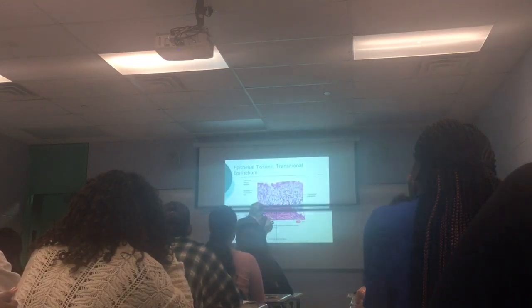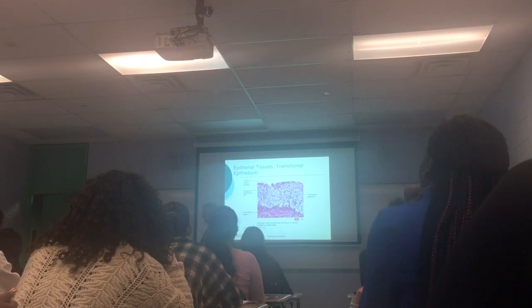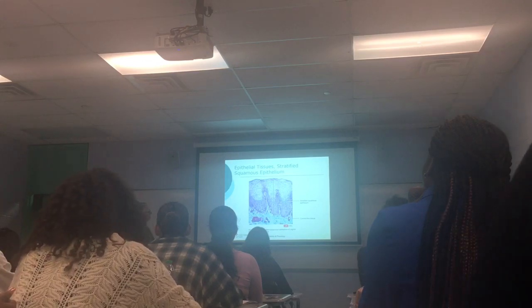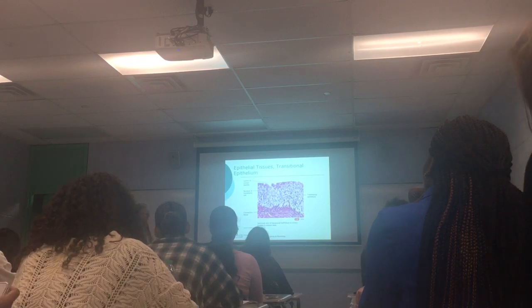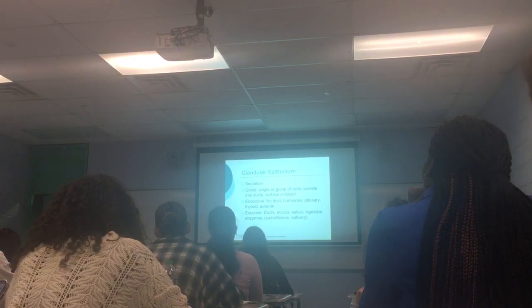So anytime, like if you're looking on a test, like not in here, but in cytology classes, okay? A lot of people mistake this for squamous cells, but they're not flat. See, watch, let me go back. See, these are flat. These are very flat. Okay, these look more rounded than anything else. But if you look at the connective tissue underneath, the elastic connective tissue, you know it's transitional.